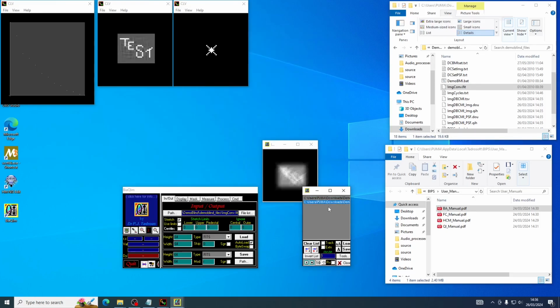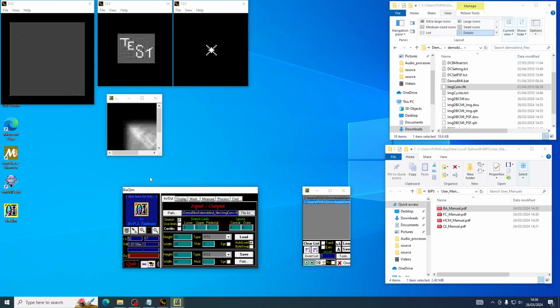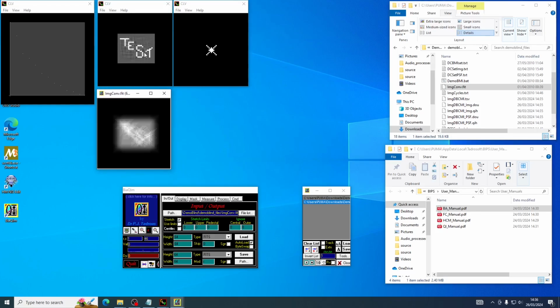And you can see that the end result, however, let's make this times 4, so it's the same size as our others. So this was the starting point for our image, and that's the end point after deconvolution. And this was the starting point estimate for our PSF, and that's the end point for deconvolution.